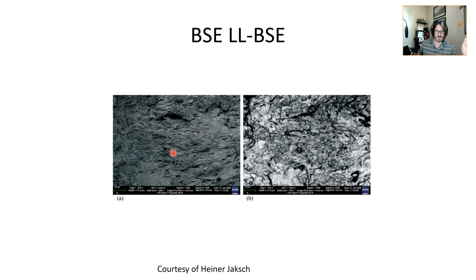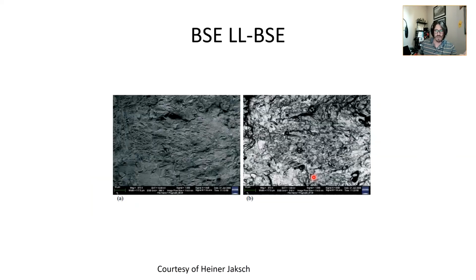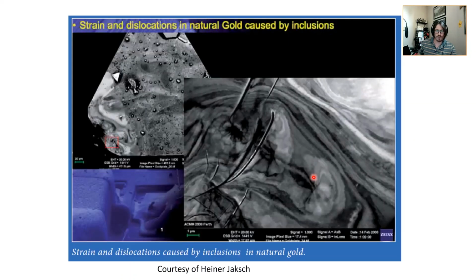Backscattered electrons, so this is traditional Rutherford versus low loss. You're getting much different contrast mechanisms, so the idea is you get more information. And again, all discerning differences in black and white. Okay, no colorized micrographs here, and colorized micrographs are actually fake color anyway, unless you're looking at an X-ray map. Okay, just throwing that out there. We'll talk about X-ray analysis here pretty soon.